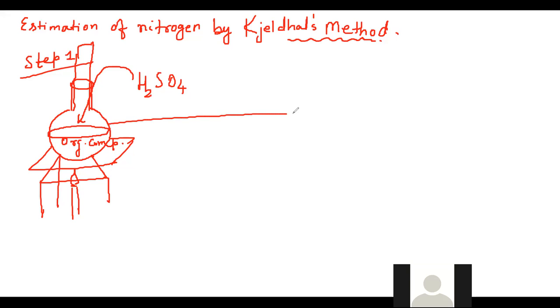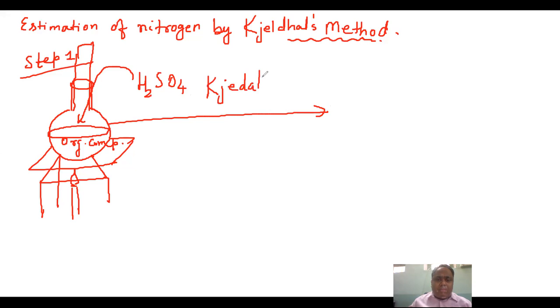So this process is called Kjeldahl'ization or digestion, or breaking the molecule into smaller molecules.